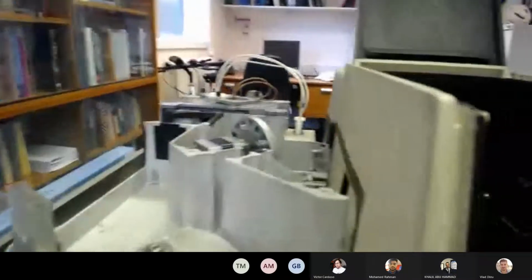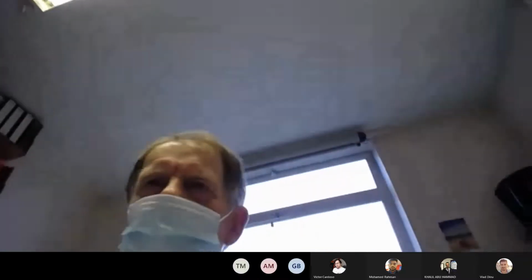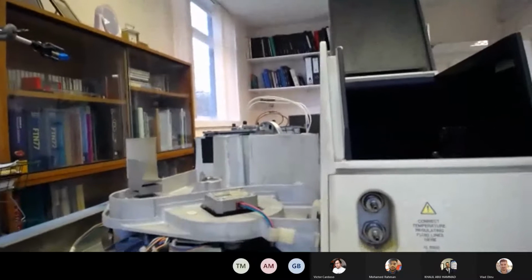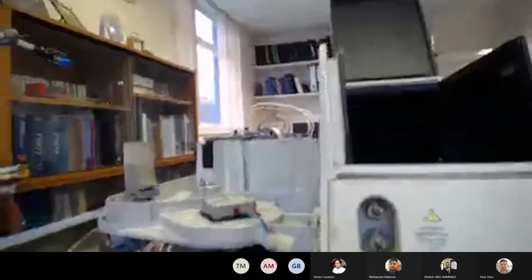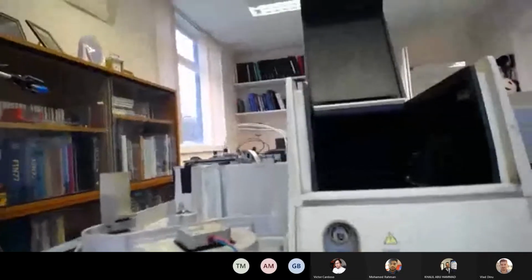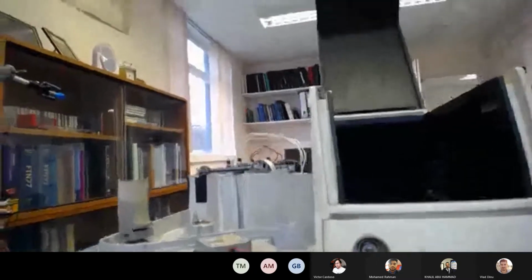Thank you. All right. That's the problem now with scientific instrumentation. Everything is all beautifully boxed up, and you don't get a chance to see what's going on inside the instrument. And you know, this stuff here is far more interesting than having a big white box or grey box outside it and pressing buttons. But of course, it's got to be enclosed in this case for two reasons. One is you don't want any stray light getting into the instrumentation, and two, because of safety.